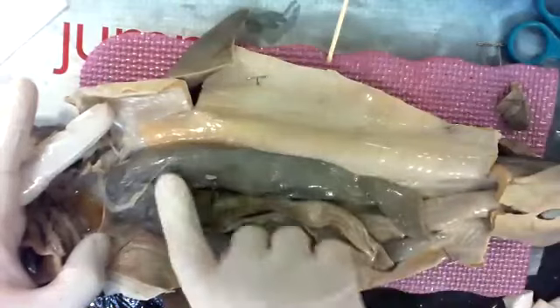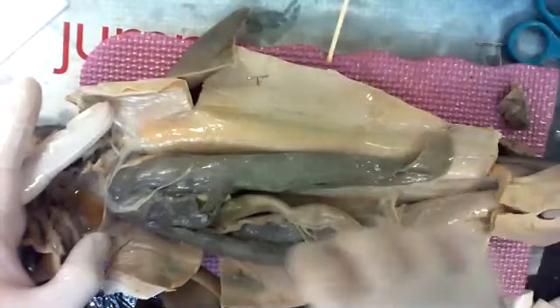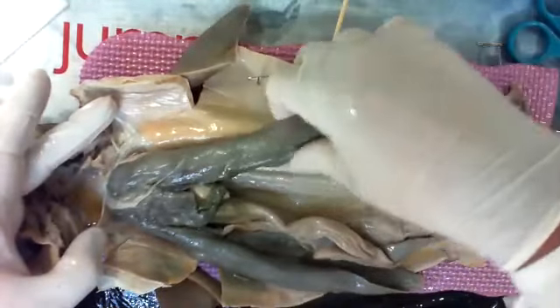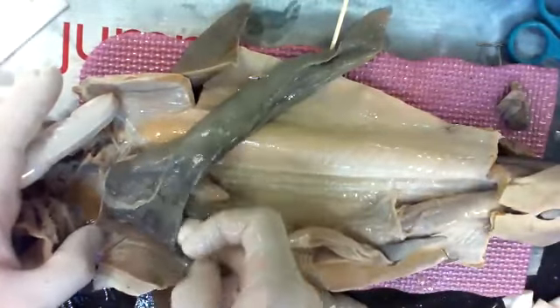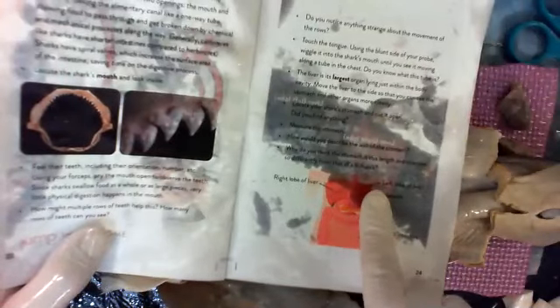The first organs you're going to move out of the way are these big, they look like, I don't know, eels or something. They're not eels. They're the liver. So here's the left lobe of the liver. I'll pull over to the side. Here's the right lobe of the liver, and the middle lobe right here, this guy. If you look at us, oh, wow, that's really slimy. Here's our liver. Ours goes more sideways across. The shark's goes lengthwise. So we have two lobes. We have a left and a right.